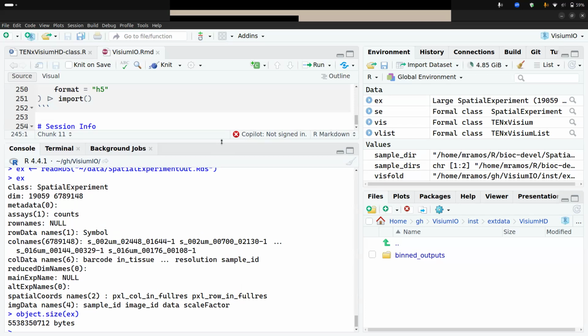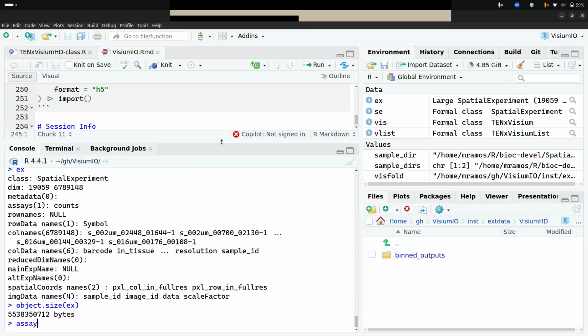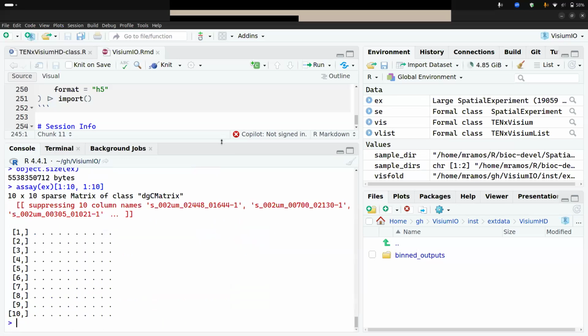This is the 2 micron. So I have a job where people said that the 2 microns is good, they recommend using that data. These are not real resolutions. These are 2 micron files. Then what they call the 8 micron resolution is a sum, they create a megapixel.